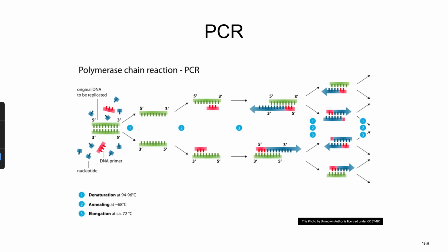And we design these primers to be adjacent to genes of interest. So if we know we want to amplify a particular gene, we're going to put the forward primer at the beginning of the gene. We're going to put the reverse primer at the end of the gene. And then those primers are going to copy by moving forward or backwards, depending on if it's the forward primer or reverse primer. So basically they're going to go in opposite directions of each other. One's forward, one's backwards. And then it's going to fall off, and we can make many copies of that centralized region based on this process.